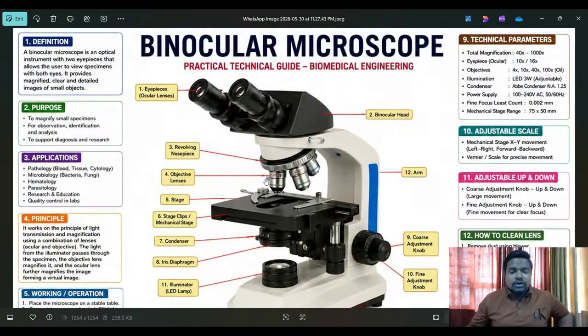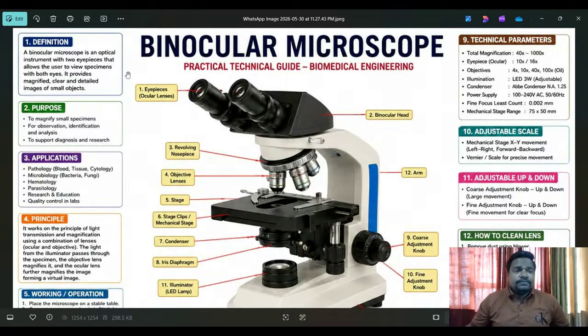If you take any binocular microscope, it looks like this, but sometimes the features change and differ between companies. Olympus, Magnus, Laborative, and locals are also available, with different manufacturers in our local market. Depending on requirement and interest, the hospital will choose the equipment. I'm talking about all binocular microscopes used in a laboratory, because without this equipment no further laboratory services can be done.